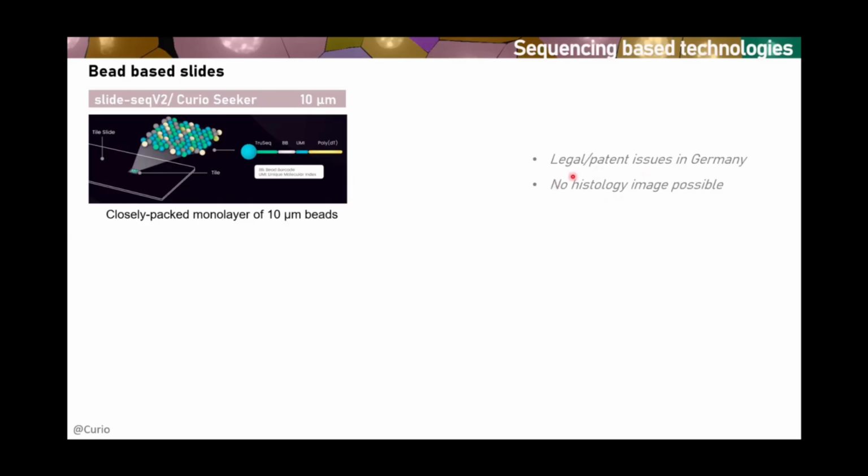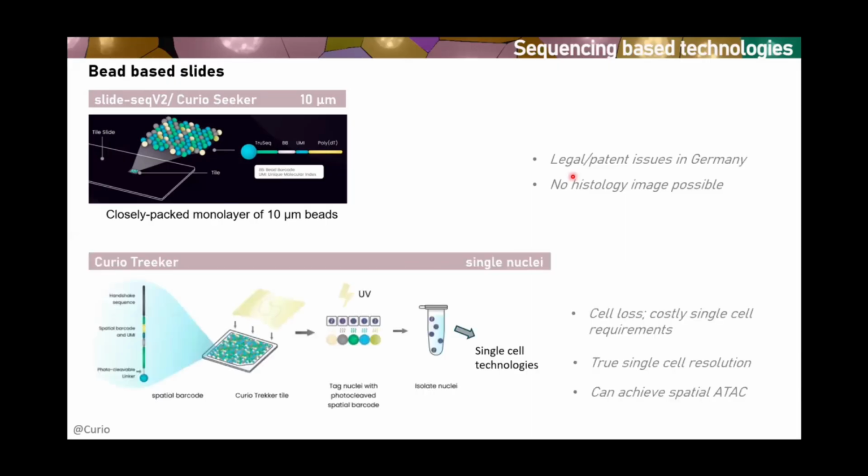But another issue to keep in mind in this technology is that we cannot really take an image of the tissue before we start the process, but still the data is very useful, and according to the papers, it's looking anyway very nicely. Then Curio released another method.